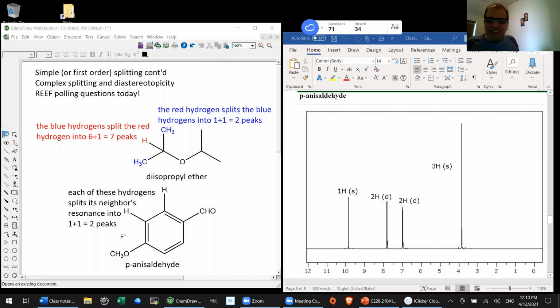And again, those chemical shift ranges in the textbook are only a guideline. They don't mean to indicate this is where every last example of this type of hydrogen will definitely 100% show up. They're just guidelines. That's why I do not recommend you spend a lot of time trying to memorize them. But I also am hoping that you look at enough spectra that you're not needing to look at that table constantly in order to solve spectroscopy problems. It's for things like that sometimes students say they're not able to finish the exams on time. So you have to become fluent enough in the material, so to speak, that you don't need to look up every single thing.